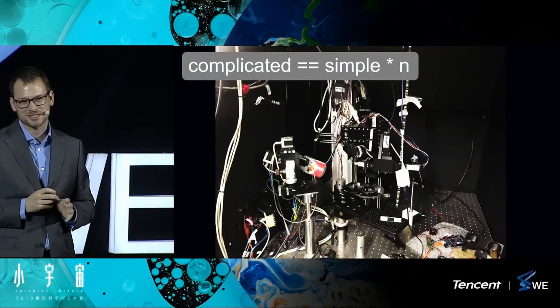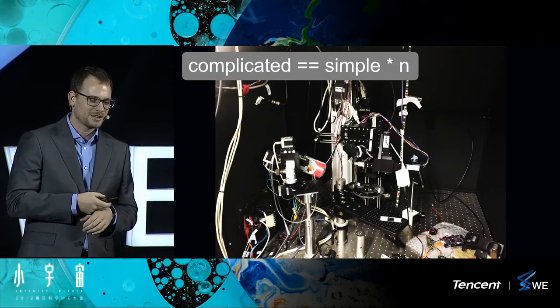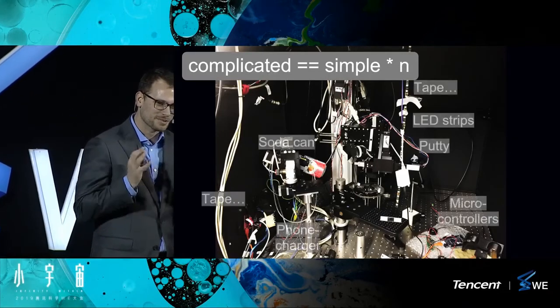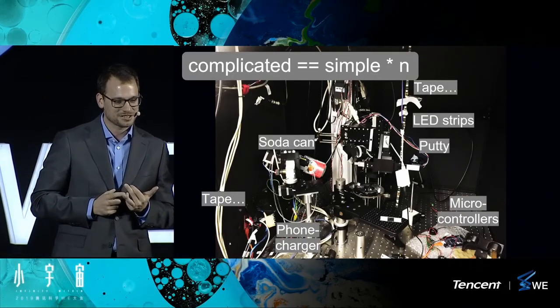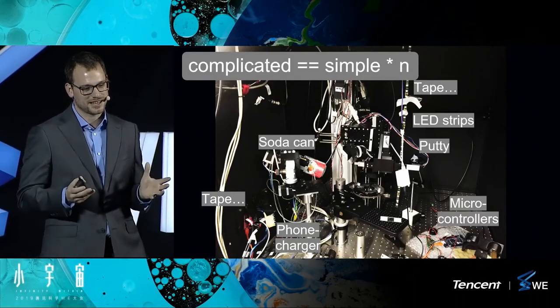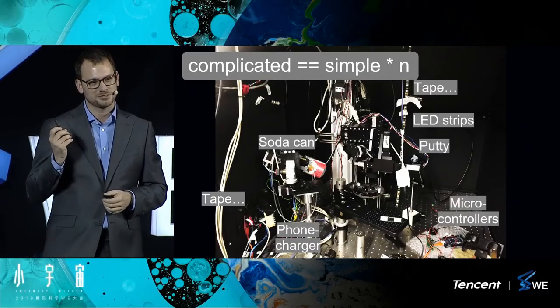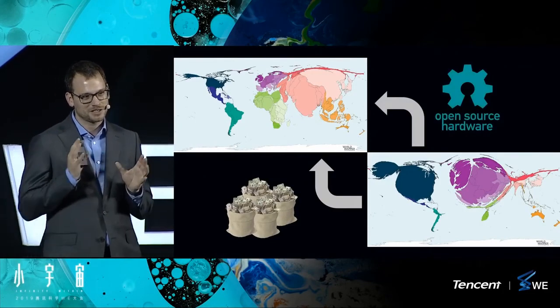So already now, if you go for an open hardware approach to building one of those, we've slashed the cost by more than 50%, and this trajectory is going down rapidly. Also, you should take these things with a bit of a pinch of salt, because two-photon microscopes don't look like the thing I showed. This is what it actually looks like in our lab. And I just want to highlight a few things. We improvise a lot. So ours are basically held together by hope and tape. So we've got tape, we've got LED strips, we've got putty, we've got a soda can. Turns out that's really good for electrical shielding. So we're combining the low-cost and the high-cost approaches in the lab. And this is actually the microscope that generated the picture I showed you in the beginning. So maybe instead of using money, we can use an open hardware approach.